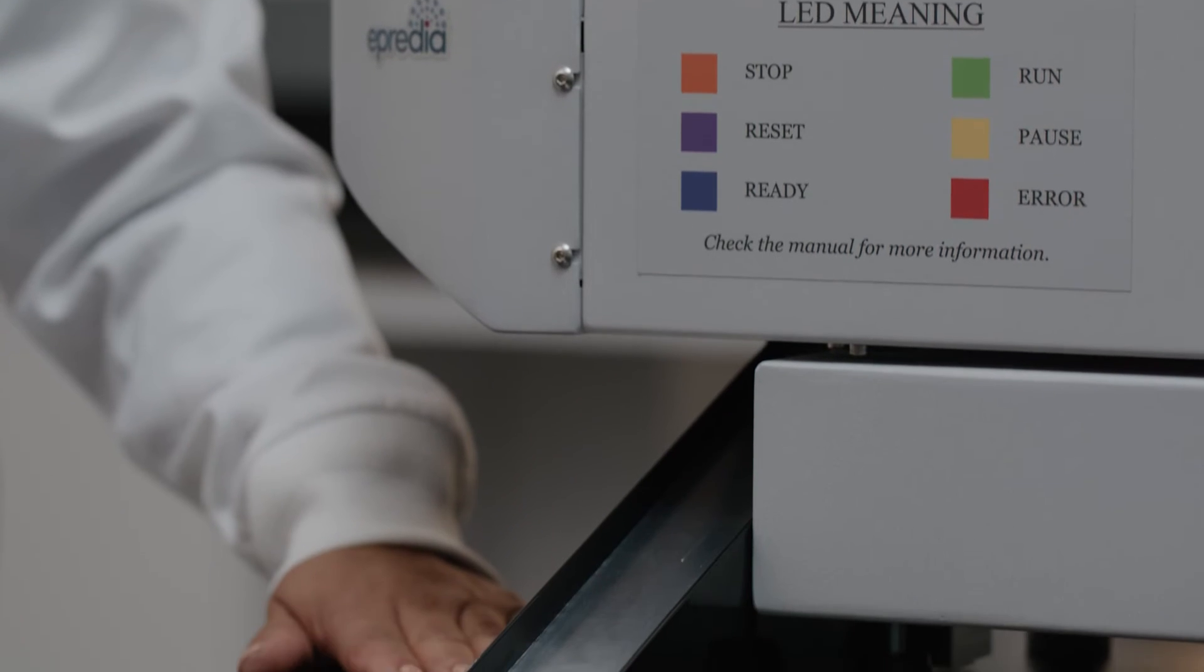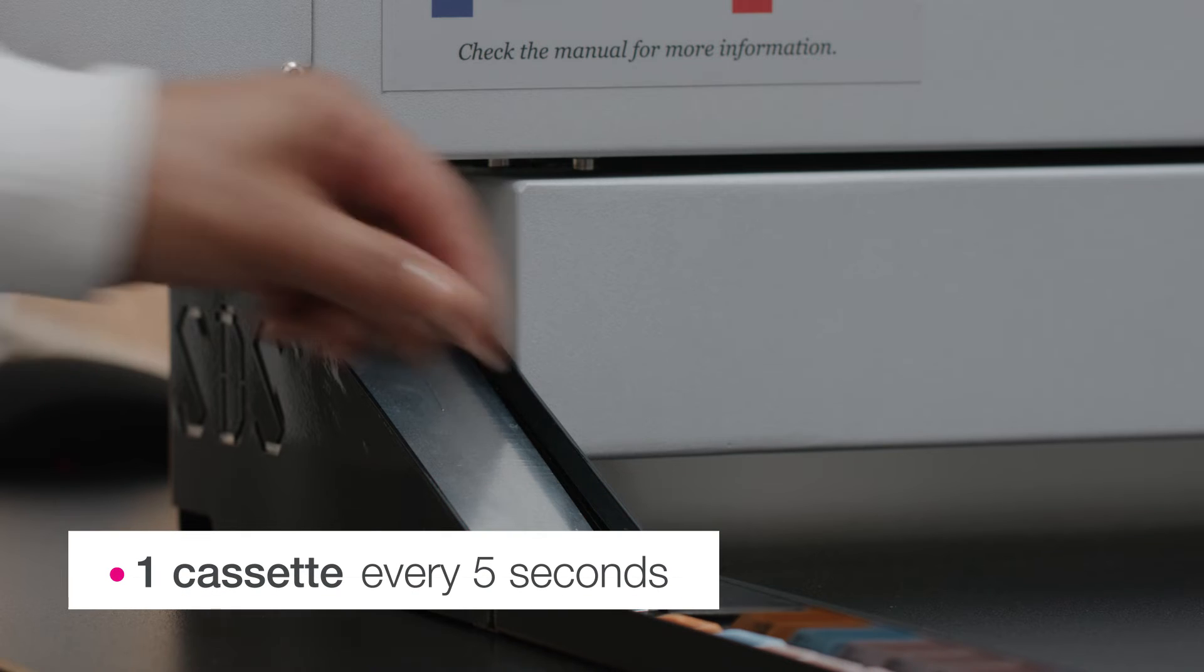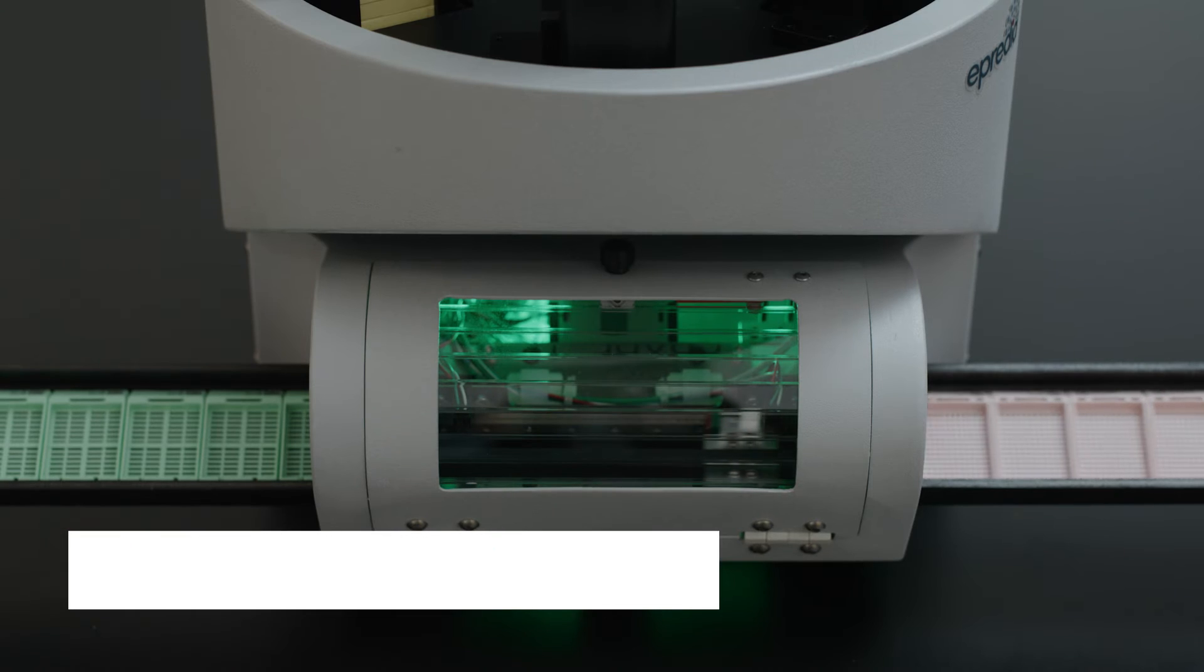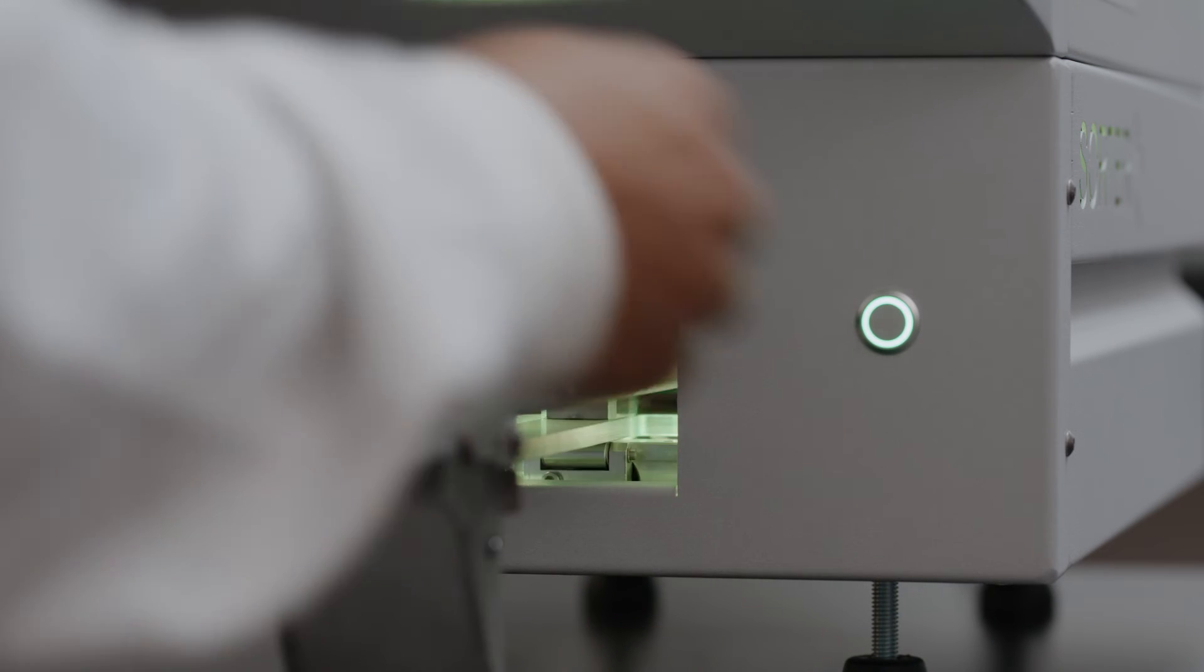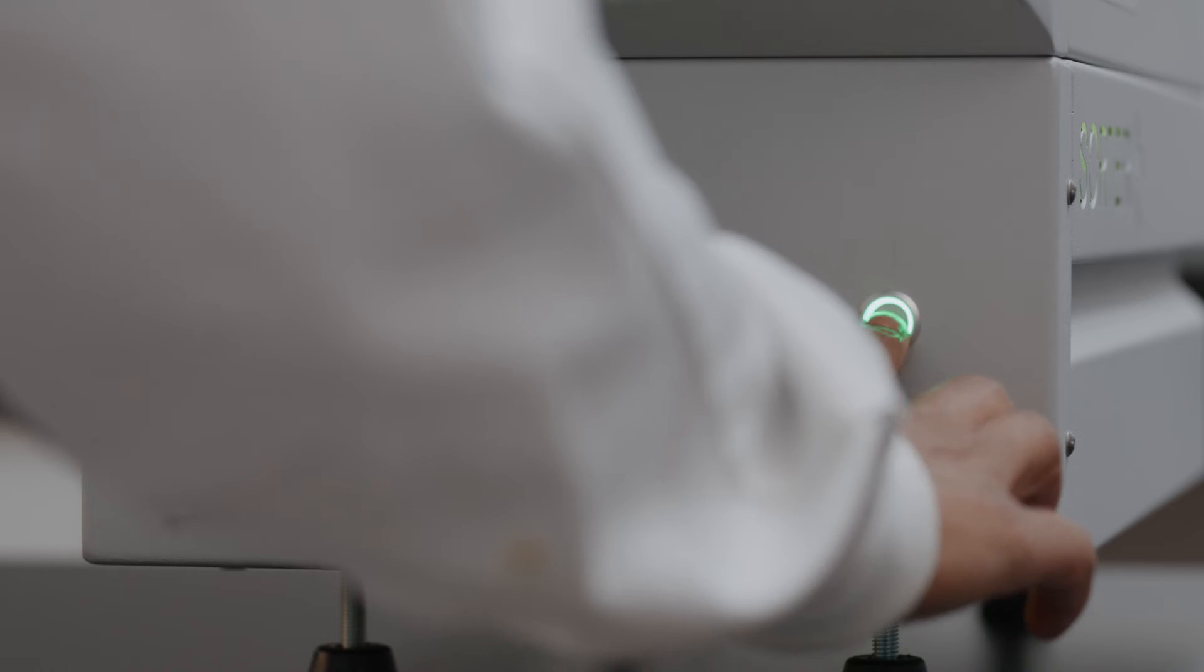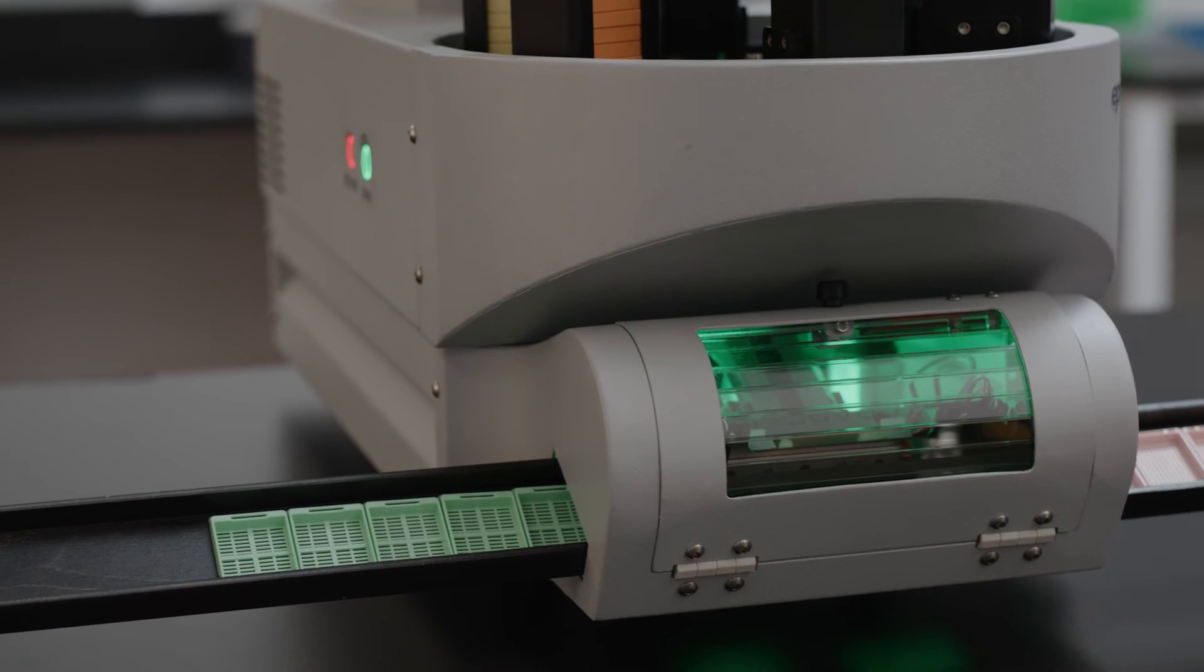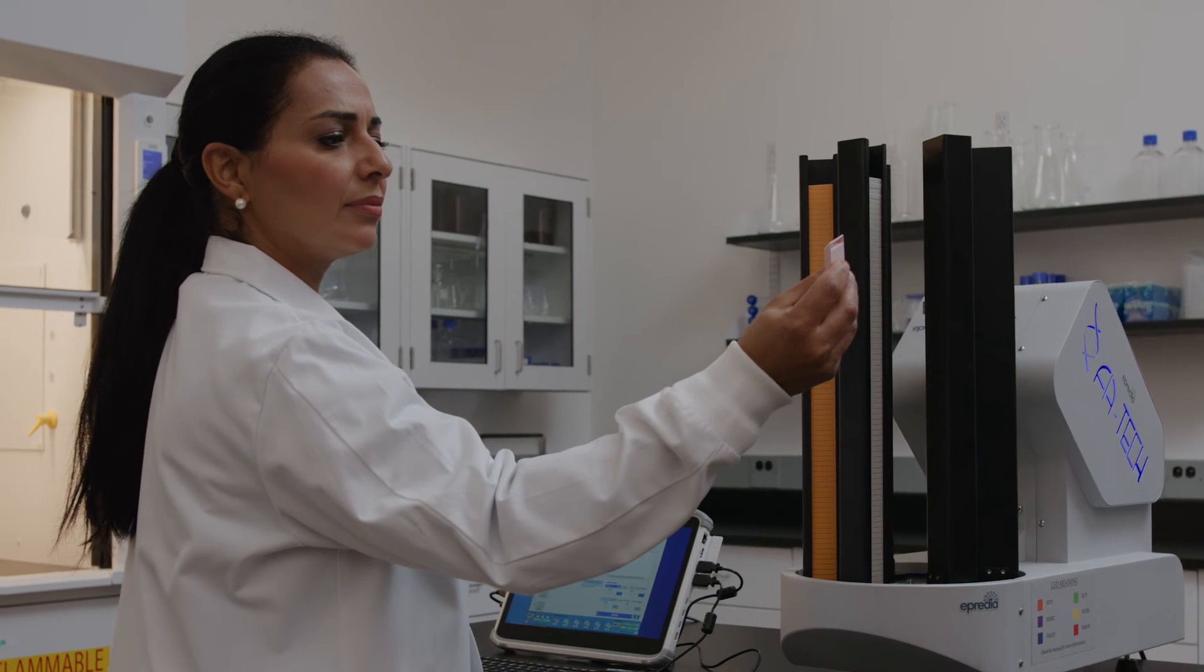With its fast printing, one cassette every five seconds, and ease of use, the Vega helps you increase productivity and improve laboratory workflows. Its laser technology eliminates the need for ancillary components such as print heads and ribbons, reducing cost, instrument downtime, and maintenance.